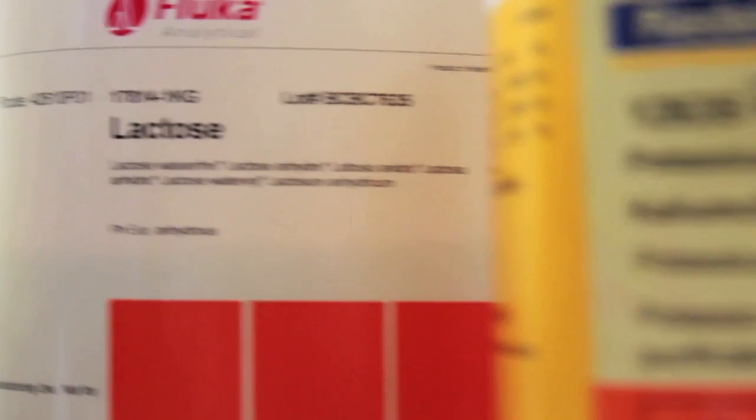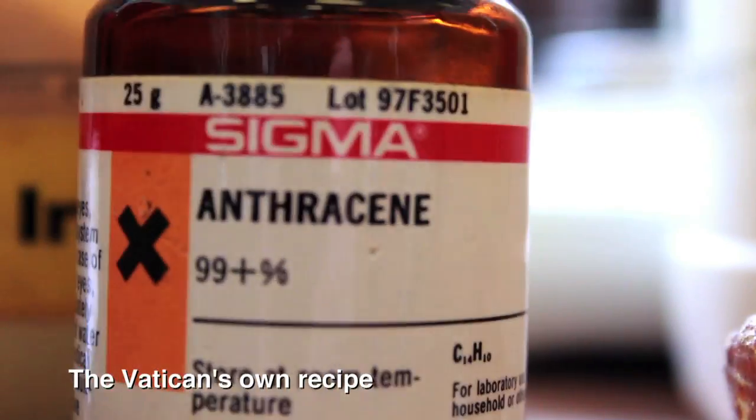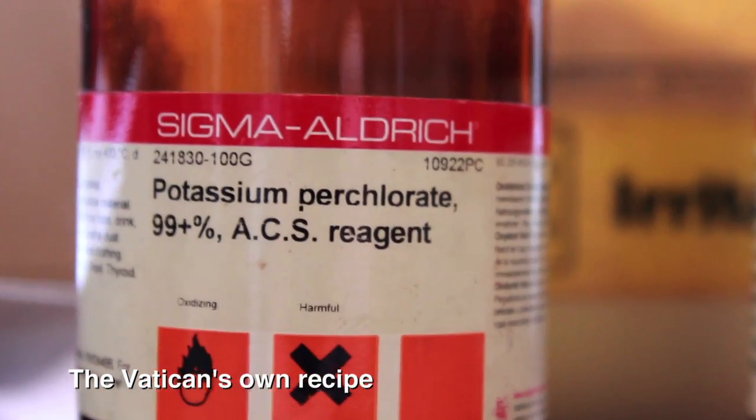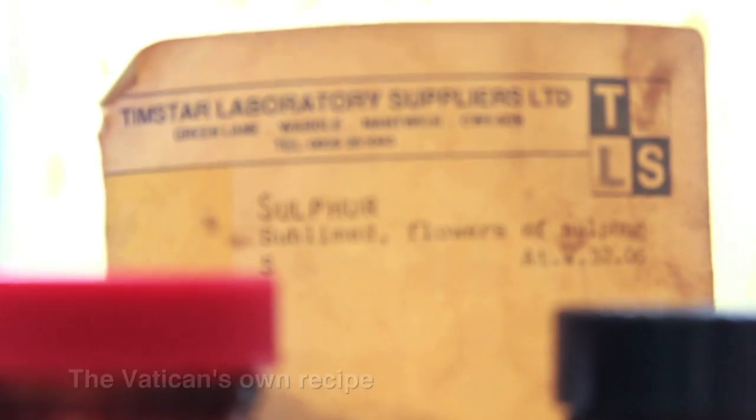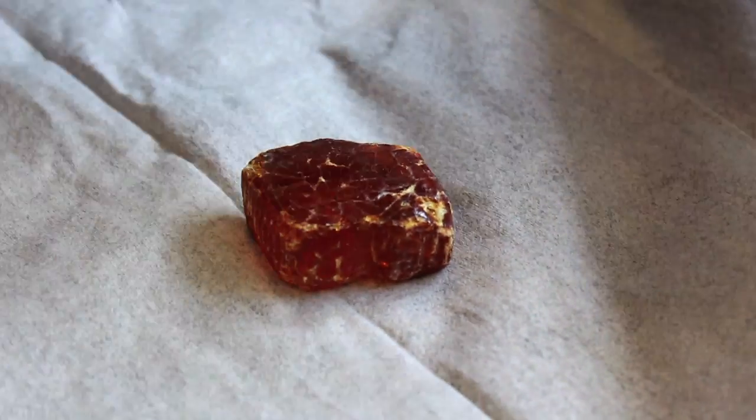We have here all of the ingredients to make either black or white papal smoke. We have lactose, anthracene, potassium perchlorate, sulfur, potassium chlorate, and some pine resin which is this stuff here that comes out of a tree.